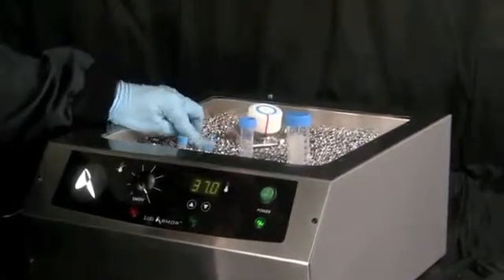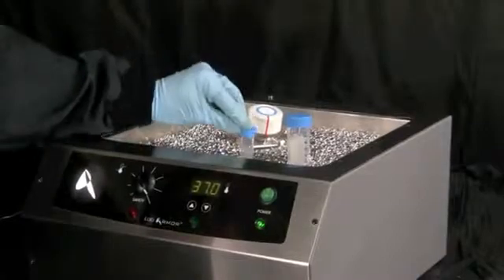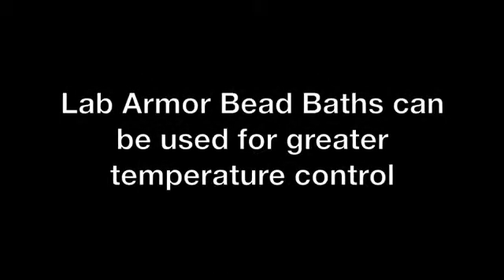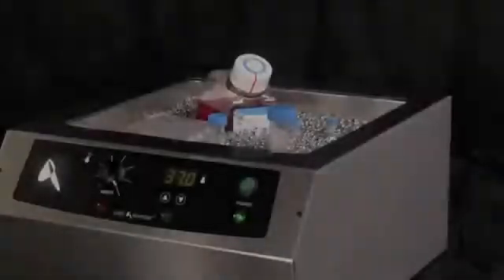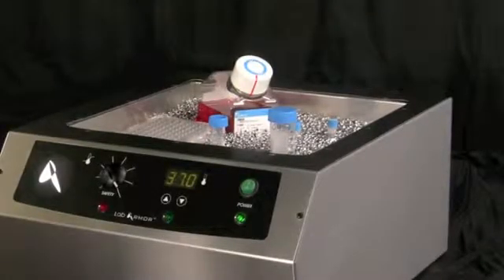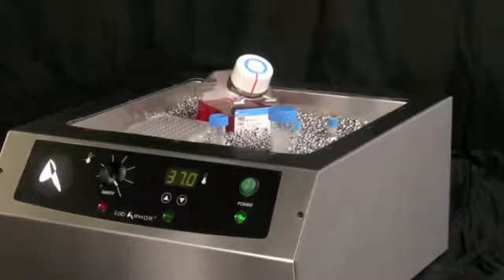For precision applications, you should validate old water bath protocols to avoid under or overheating samples. Use a Lab Armor bead bath for incubation above 50 degrees centigrade up to 80 degrees centigrade to avoid uneven temperature gradients typical of most conventional water baths.